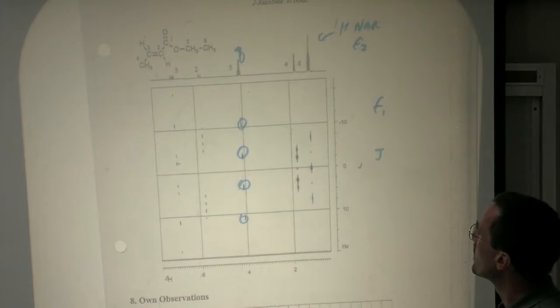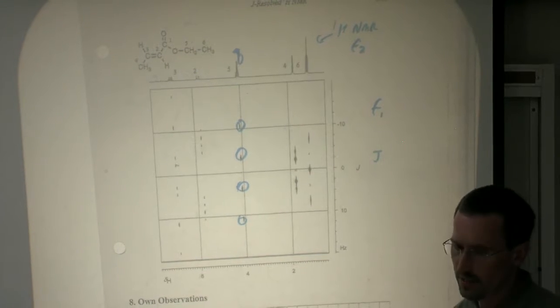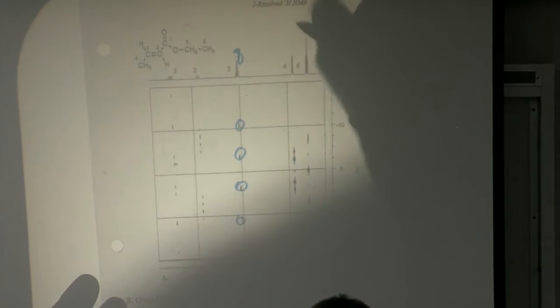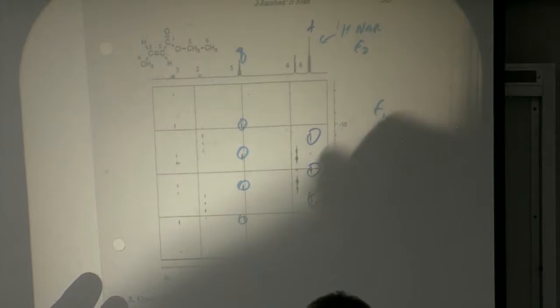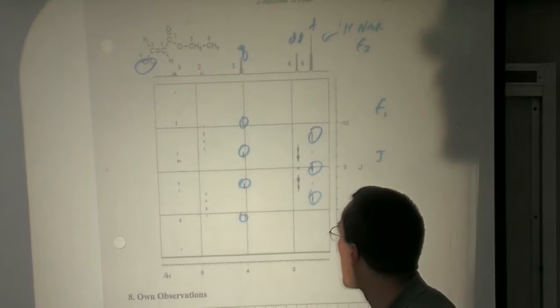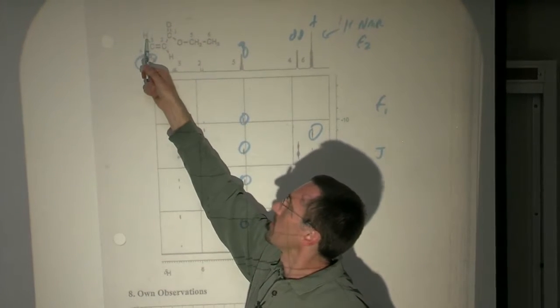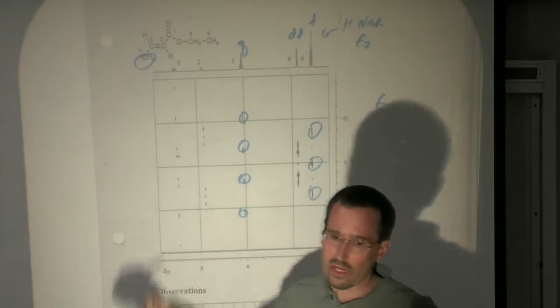This is a very, very simple molecule, but you can see what it does to the multiplets. So for example, here we have a triplet, and you see 1 main, 2 main, and 3 main peaks. There's a little bit of artifacts here. This is the methyl. You have a doublet of doublets because you've got your coupling from the methyl group to this hydrogen, and then you've got an allylic coupling over here.